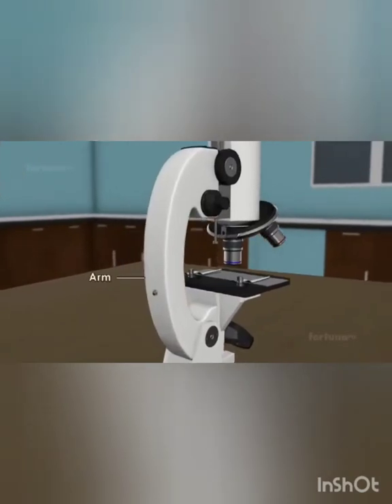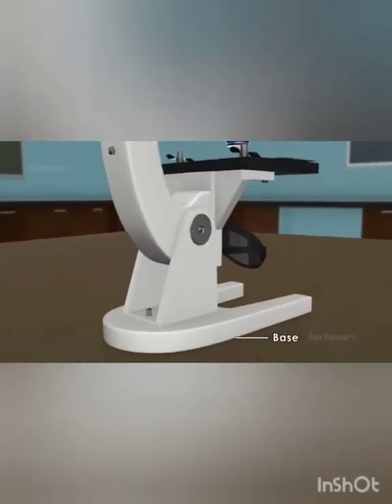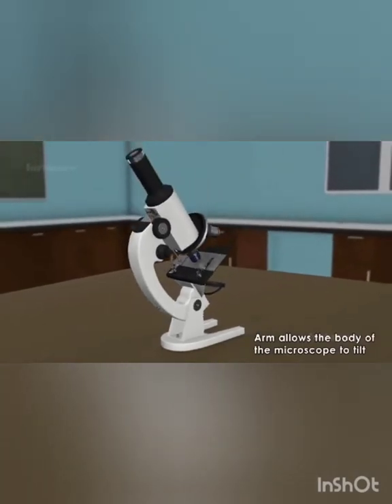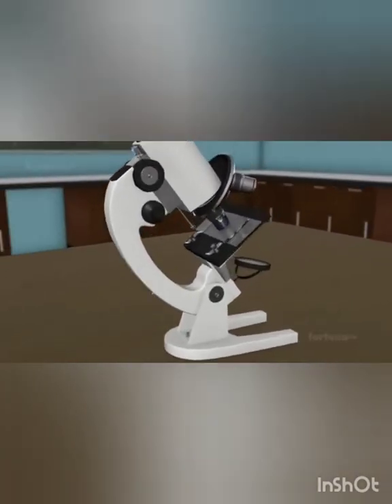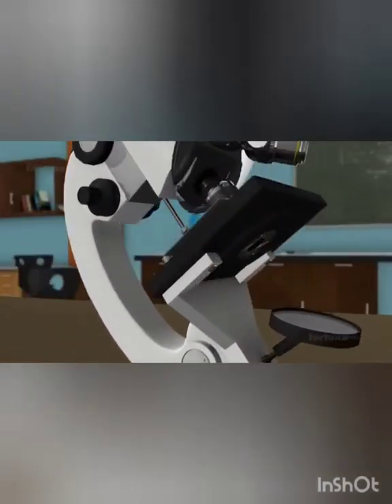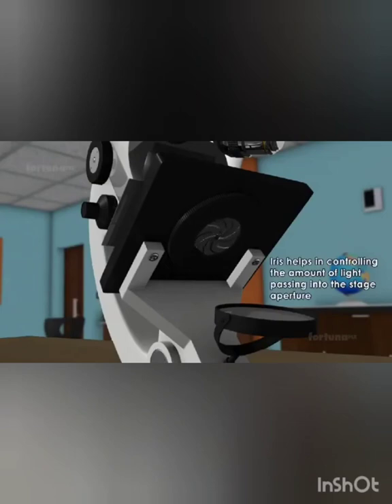Now the body tube is arranged on an arm which is connected to the base, which allows the microscope to tilt a little bit. Then there is a small mirror at the base of the microscope that reflects the light through the stage aperture above. Above the mirror you can see an iris diaphragm, which helps in controlling the amount of light passing into the stage aperture.